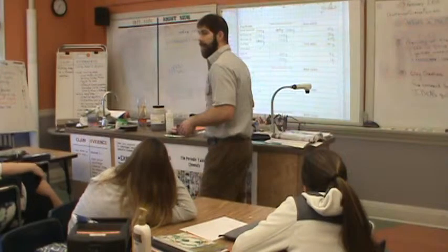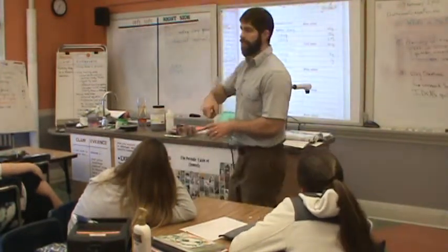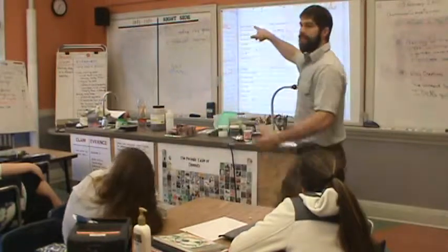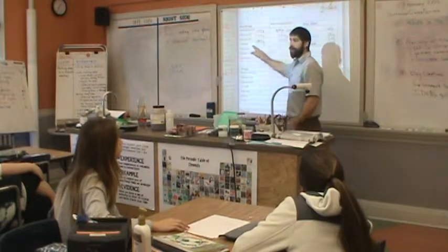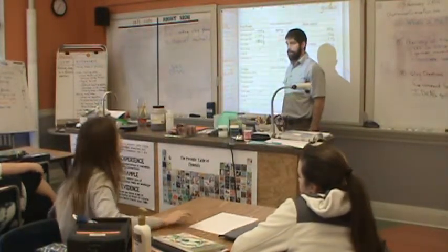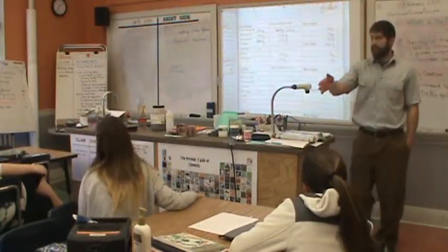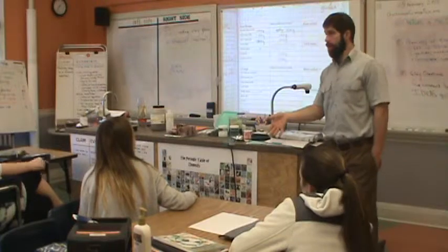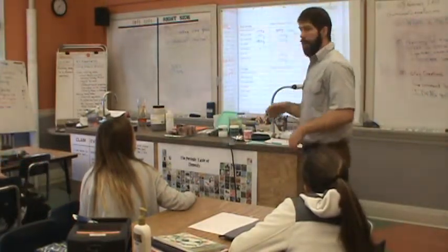Container, let's say like a 600 milliliter beaker, and then you're going to mix it. It says water, but it doesn't tell you how much. Somebody that was here yesterday, how much water do you put in there? Not milliliters, but how do you know? About 60, peanut butter. Okay, about 60, but you say creamy peanut butter. About a little bit like a runny, creamy peanut butter.